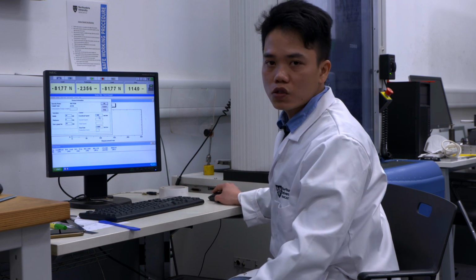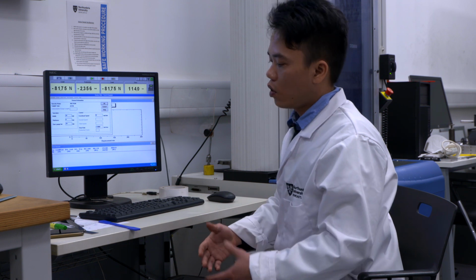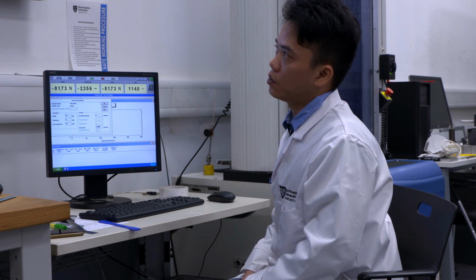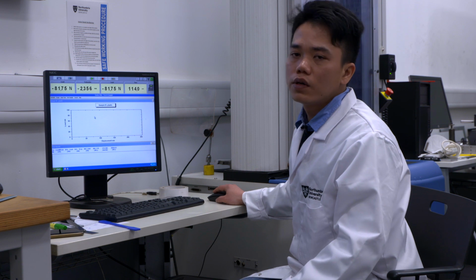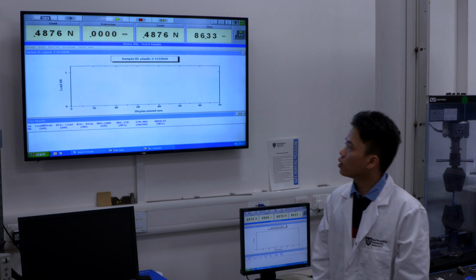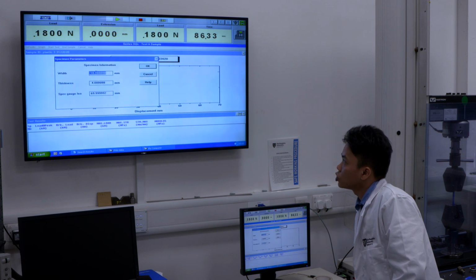I choose the crosshead speed for plastic specimen is 5 as well to make it consistent. So for elastomer plastic like this, you can choose even higher speed. But in this case, I choose 5 for all specimen. And the data rate will be 1 as well. And click OK to start the setting. So now we're gonna deal with the last specimen, plastic one. So balance the load again and the displacement, and then start the test. Check the dimension.